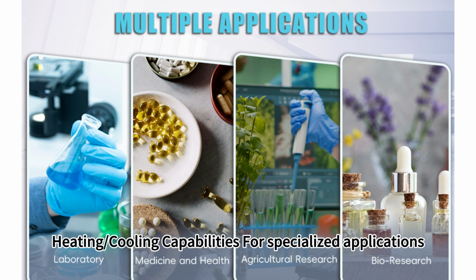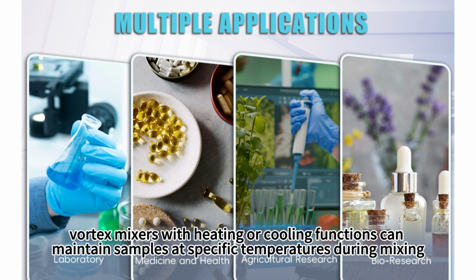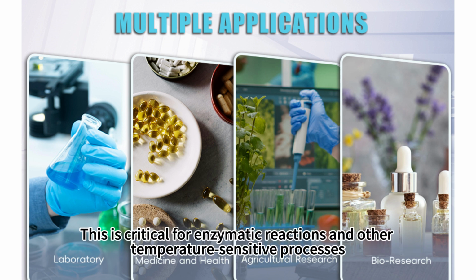Heating and cooling capabilities for specialized applications. Vortex mixers with heating or cooling functions can maintain samples at specific temperatures during mixing. This is critical for enzymatic reactions and other temperature-sensitive processes.